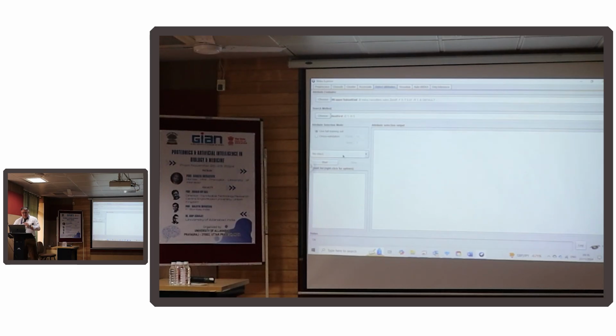So I set, as I did before, my class. I can put cross-validation into this as well, so I can use cross-validation to check how it's doing over multiple views of the data. I'm not going to do that because it takes more time. But if I click start, it's run through it already.